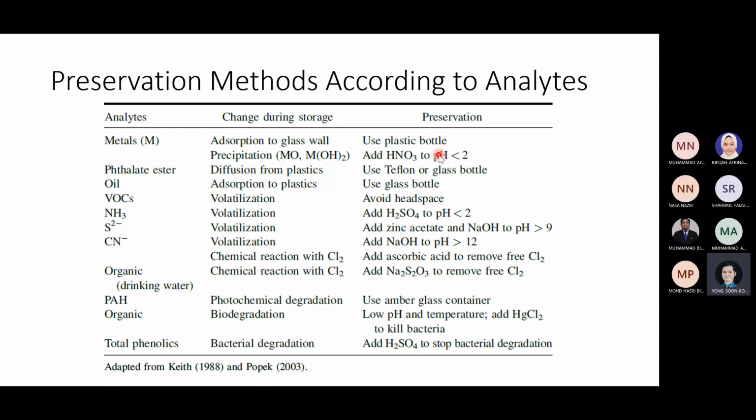Because once it is acidified, these metals will not precipitate, they will not form sediment, they will dissolve in the water. So what you measure is accurate. Okay, you might ask me why we use a plastic bottle. Why do we not use a glass bottle? We thought that glass is very clean and may not interact. Plastic looks soft or somewhat unreliable.